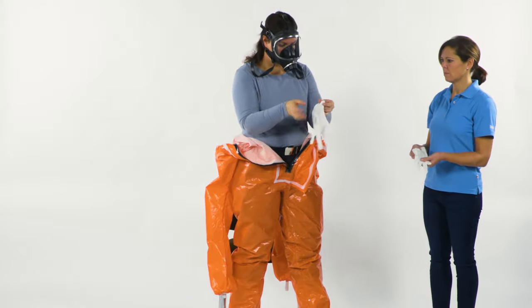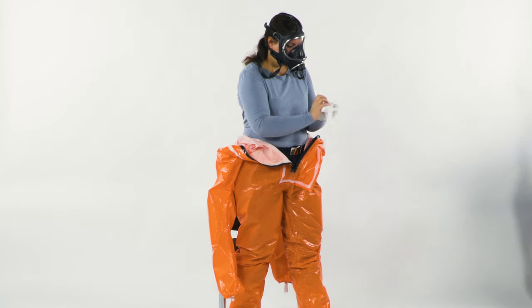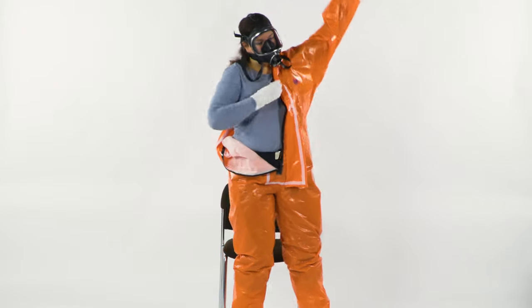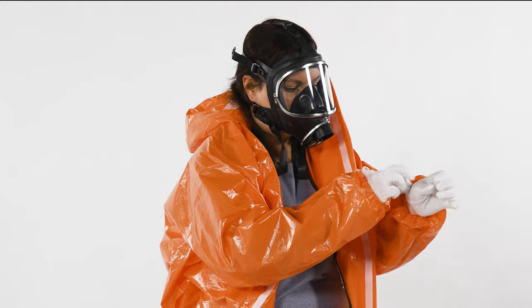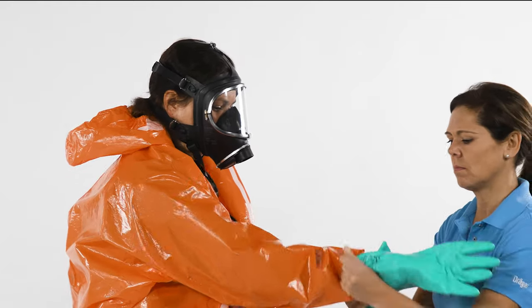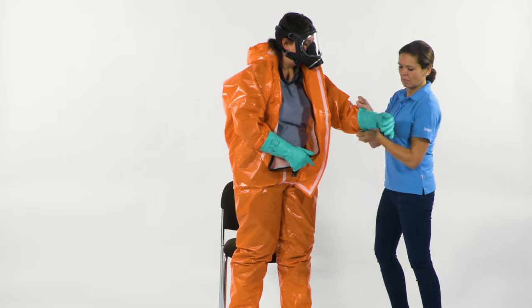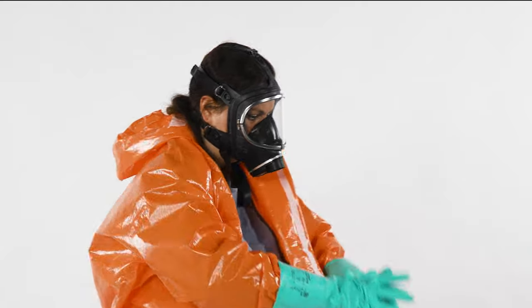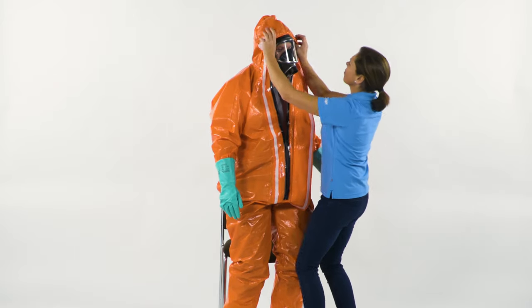For higher wearing comfort, you can use cotton gloves under the chemical protective gloves. Guide your arms into the sleeves. Pull the thumb loops over your thumbs. Then put on the protective gloves.